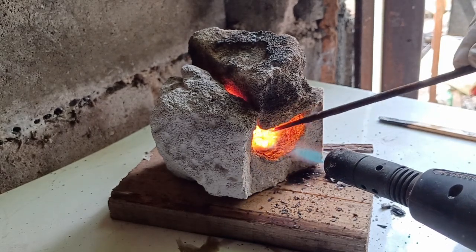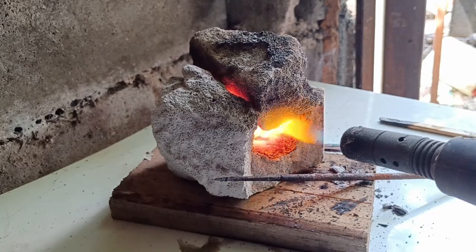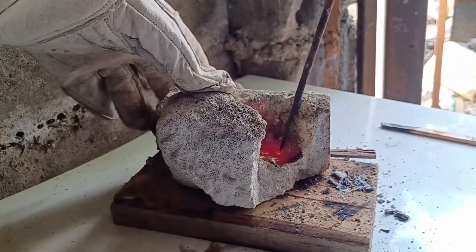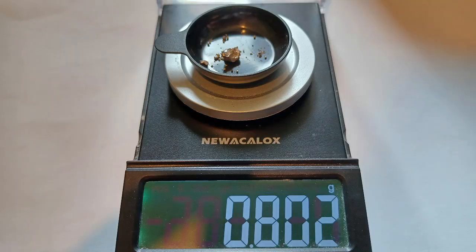Once I burnt off the remains of the paper, there was even less silver than I expected. Even adding more flux couldn't get it together into one blob, so I was forced to scrape out all of the melt, crush it, and separate the silver out by hand. I weighed it and got a pitiful 0.8 gram. Remember, we started with more than a kilo of material. These varistors are not profitable to process in any capacity.